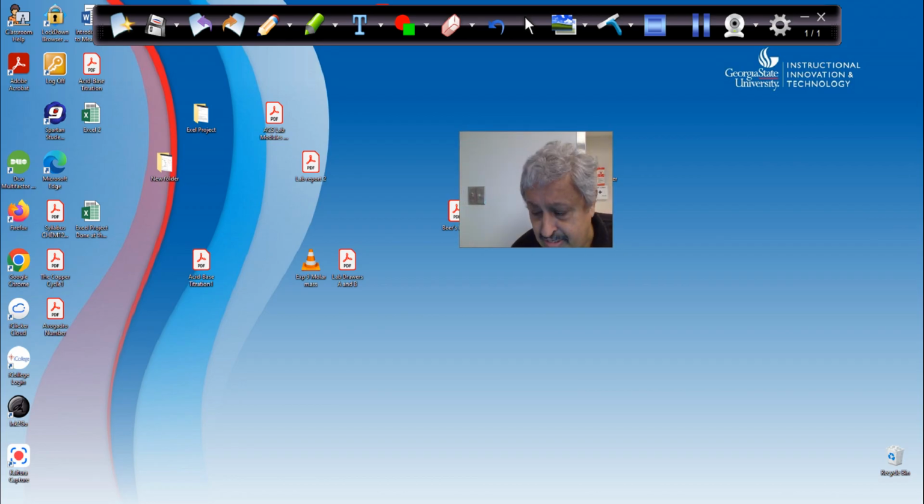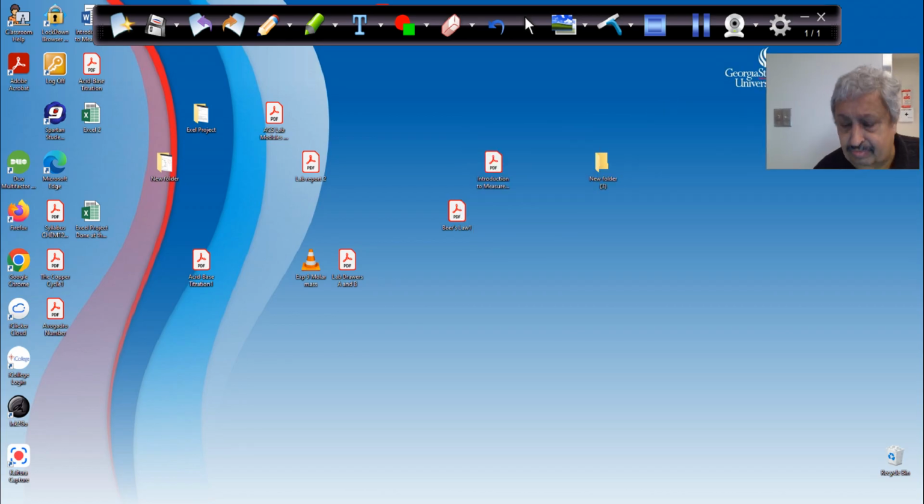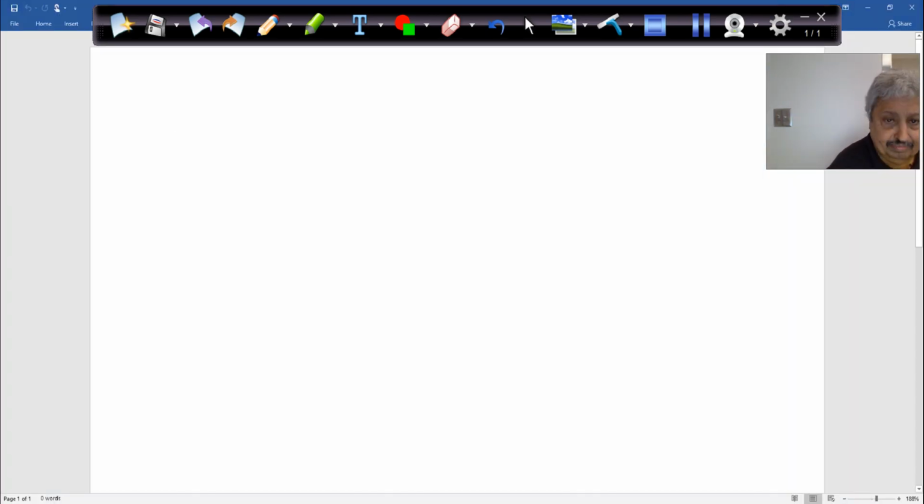Because if you have not done this, it is very important to have this structure here. Now I can tell you up front that we can see a lot of sources of error in this experiment, and somebody can tell me where those sources of error might be. We have two flasks.